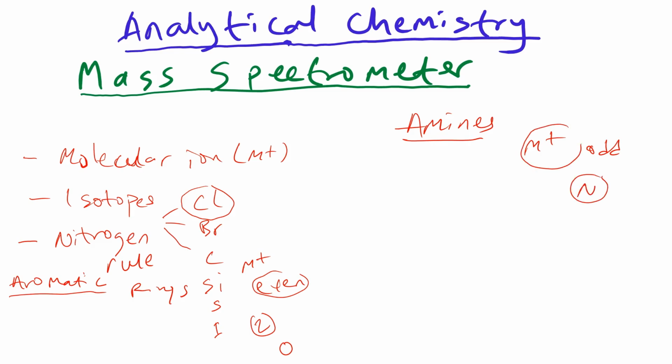Mostly, the molecular ions of straight chain amines are usually not detected.